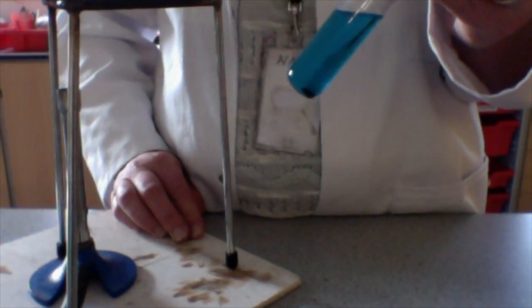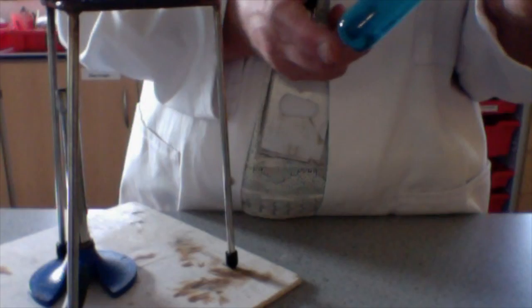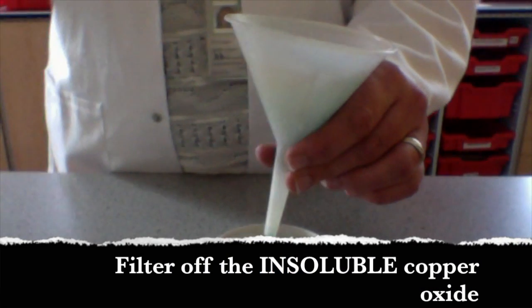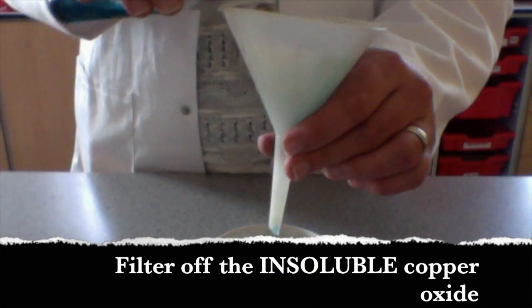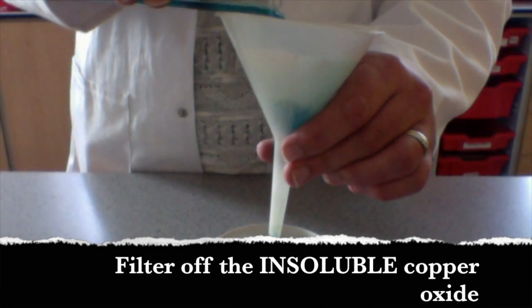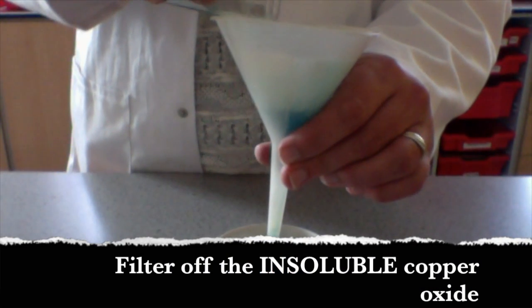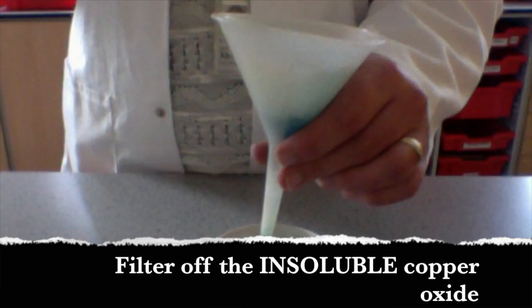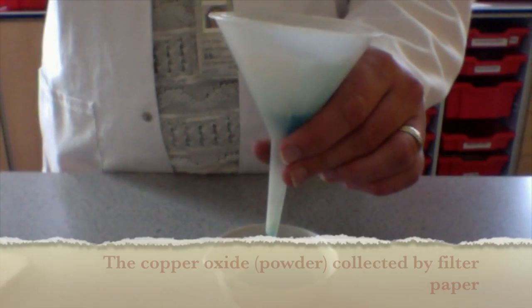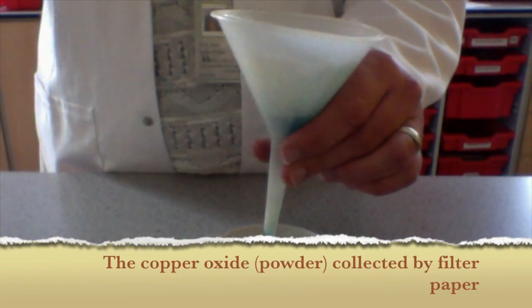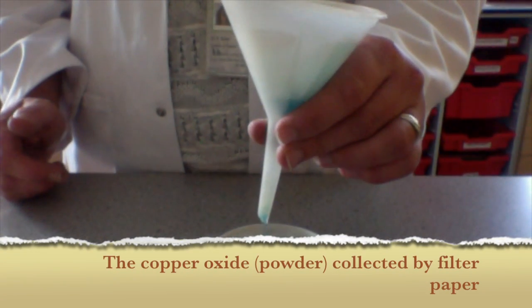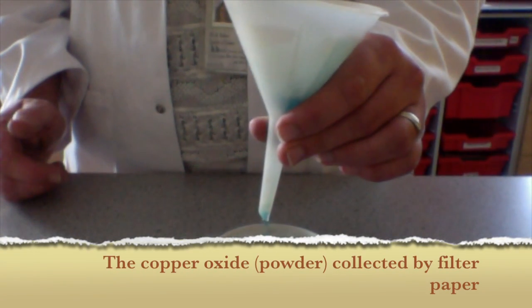But before I start heating this, I've got my Bunsen and tripod and gauze set here. Before I start on that, I want to get rid of all this unreacted copper oxide. I don't want this inside my evaporating basin when I try to form the crystals. The blue liquid is going through. That's our water containing our soluble salt, our dissolved salt. And I've collected the insoluble unreacted copper oxide in the filter paper.